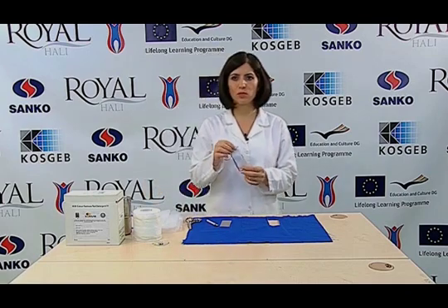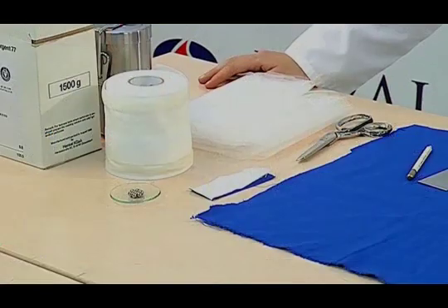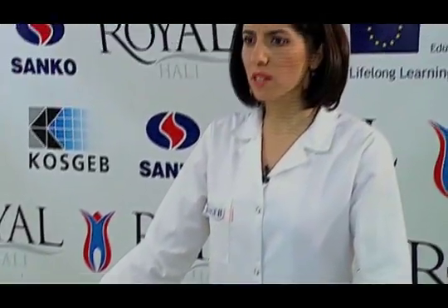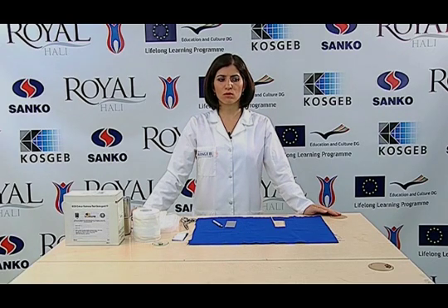The fabric specimen is prepared in this way. If the test sample is made of yarn, the 40 mm by 100 mm yarn is put between the multi-fibre adjacent fabric and the undyeable fabric and they are sewn along four edges. The sewn test samples are ready for the test.